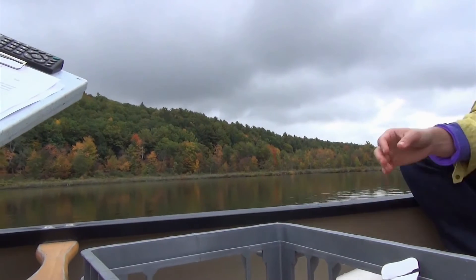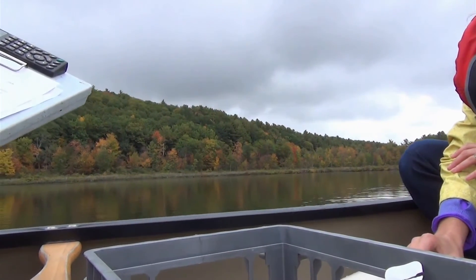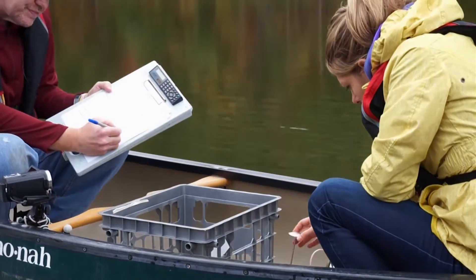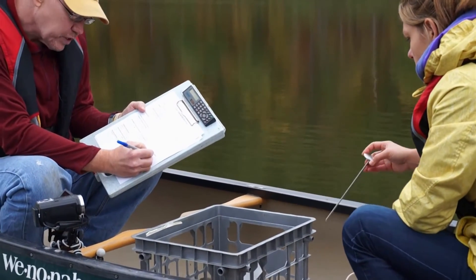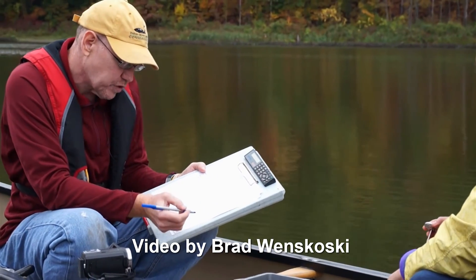At this point, the water temperature is probably stabilized. We'll record 19 degrees Celsius. Since we're not collecting a deep sample here, we don't need to record that information.